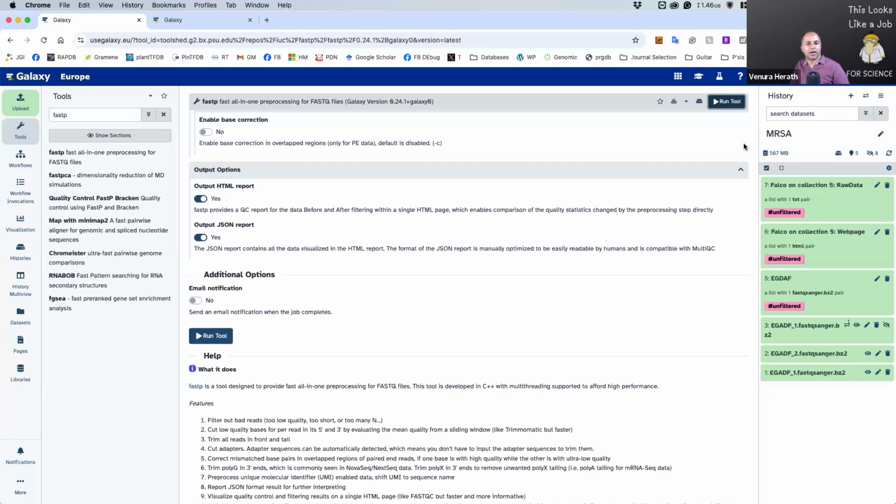Hasnan, yes, good question. How do we know the parameters? When it comes to different sequencing runs, people basically came up with default settings after comparing many datasets. Yes, I'll show you the parameter slide. Give me one second.